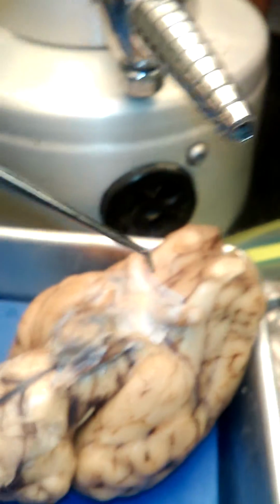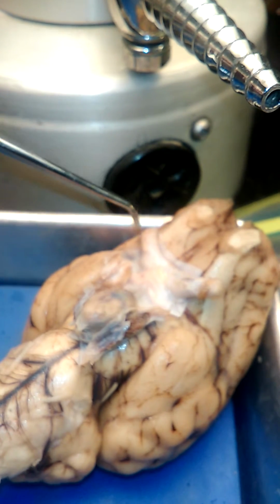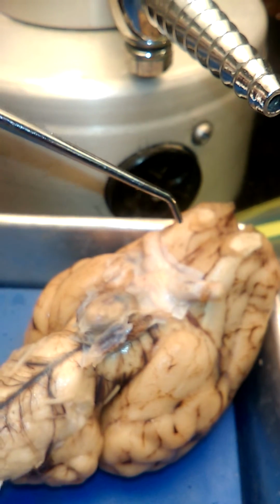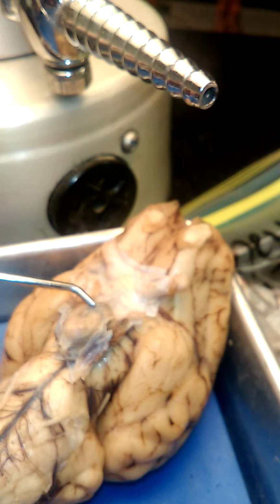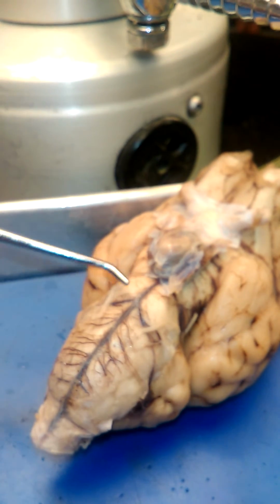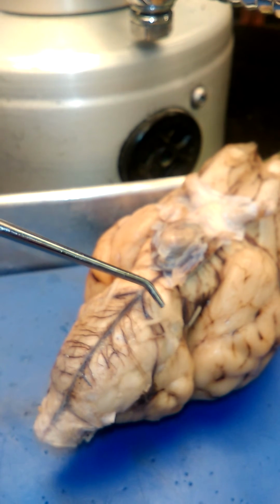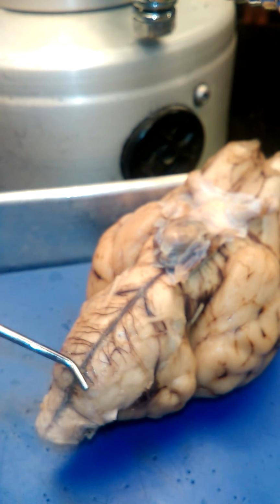Okay? And I wanted to point out that right here is the optic nerve. Right here is called the optic chiasma, okay? That's the optic chiasma, and this is the pituitary gland as well. And this is the pons area, right here on the back of the brain, or, yeah, the posterior aspect of the brain. And then this is the medulla oblongata.